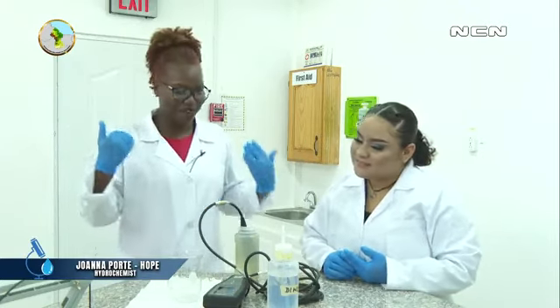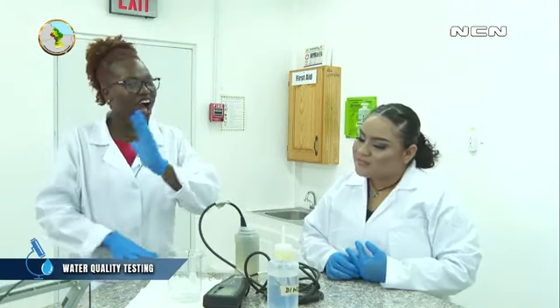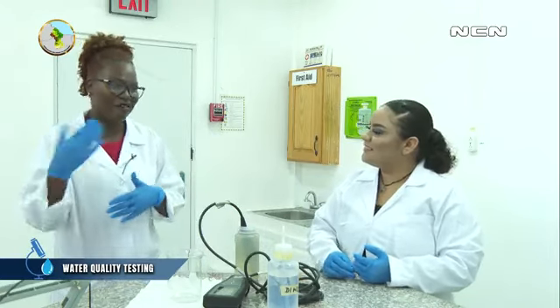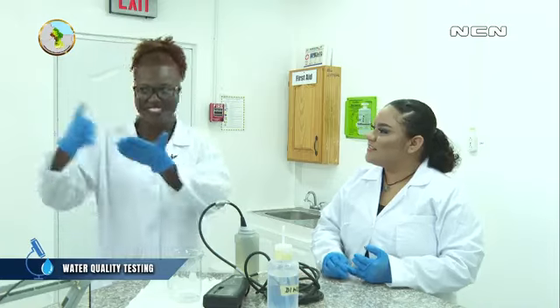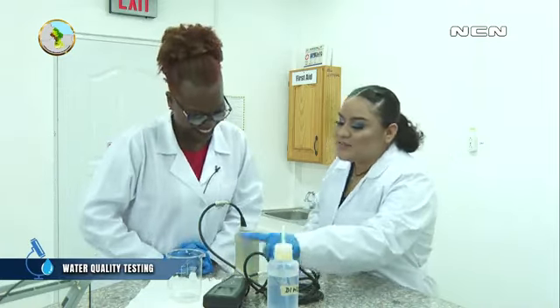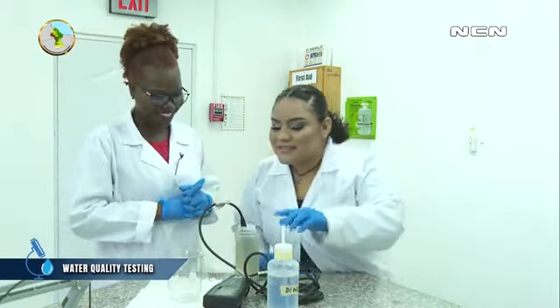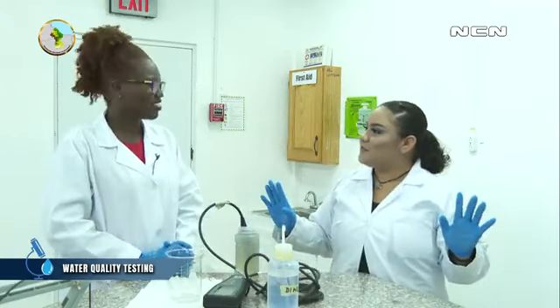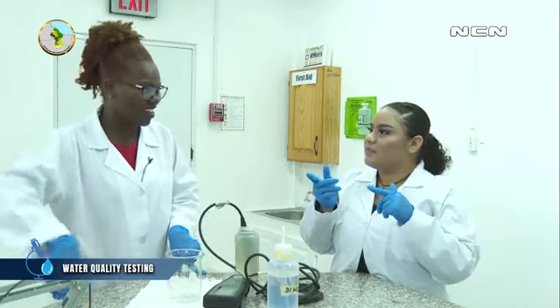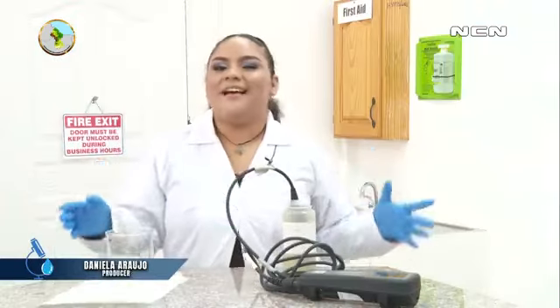Very good. So we know we're not supposed to be consuming water that's too basic, above 8.5, and we're not supposed to be consuming water that has a turbidity of over 5. So should we be consuming the water that's found in this? No. All right. Lovely. So do we round this off to 8.6? No, we don't round off. But since this is above 8.5, it's still not drinkable. You can drink from 6.5 to 8.5. Anything above that is not drinkable. Okay. And there you have it.